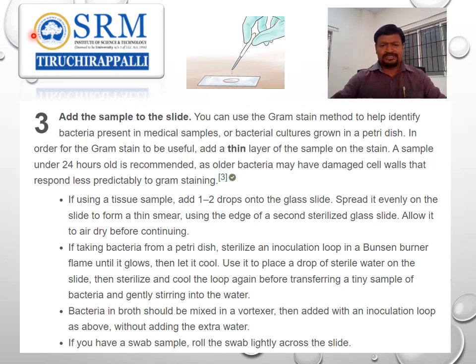If using tissue samples, add 1 to 2 drops on the glass slide. Then spread evenly on the slide to form a thin smear. Use the edge of a second sterile glass slide. Allow it to air dry before continuing.